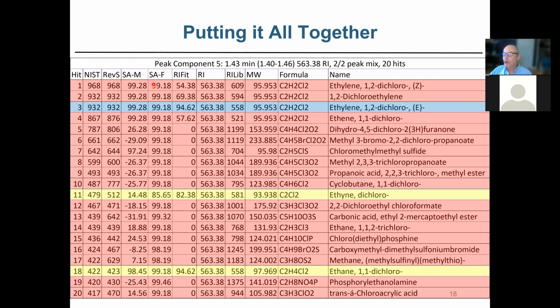We can also look at the fragments and walk through the whole spectrum and determine the formula of the fragments. That's not as well differentiating, as you can see, because there are a lot of common fragments between mass spectra. But if you want, you can go and look at the list of those fragments. And if it's really a true unknown, not in a library, it can again give you information to help you back calculate what those probabilities are.